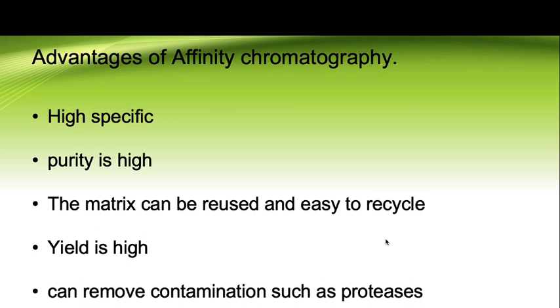Moving on to the advantages of affinity chromatography, it is highly specific and the purity is high. The matrix can be reused and it is easy to recycle. The yield is high. It also removes contamination such as proteases.